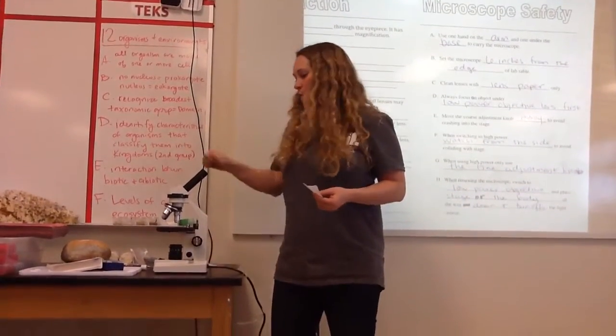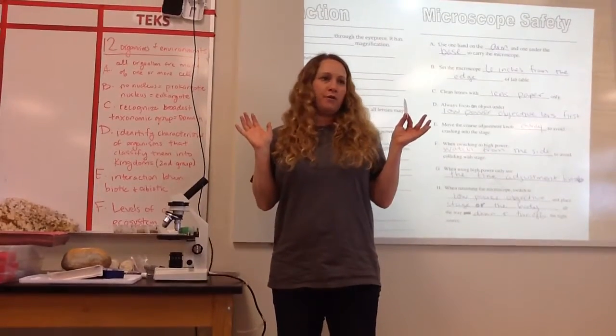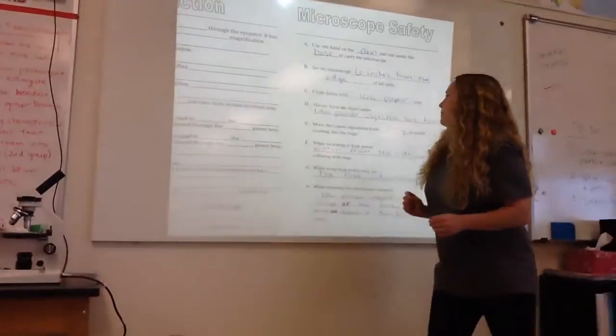T-shirt, licking your thumb and wiping it off. That's never going to happen. If I see that, I might have a science teacher breakdown. Okay? So lens paper. All right, next thing.